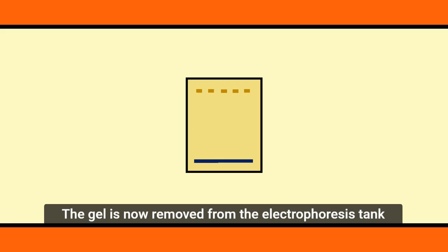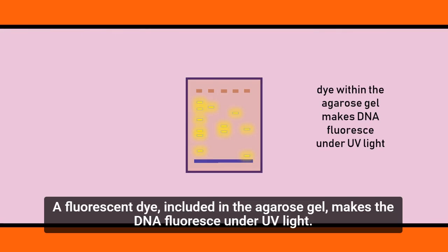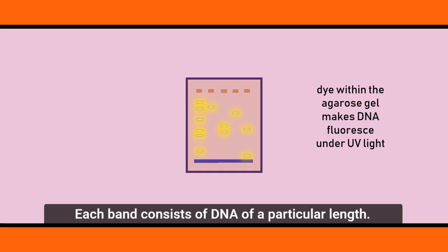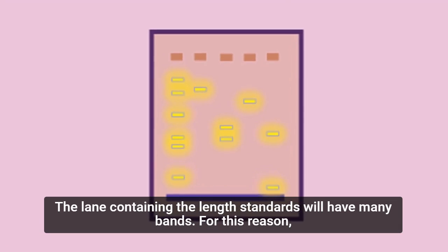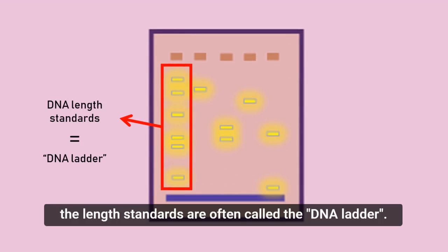The gel is now removed from the electrophoresis tank and viewed under UV light. A fluorescent dye included in the agarose gel makes the DNA fluoresce under UV light. We can now see the DNA as discrete bands. Each band consists of DNA of a particular length. The lane containing the length standards will have many bands. For this reason, the length standards are often called the DNA ladder.